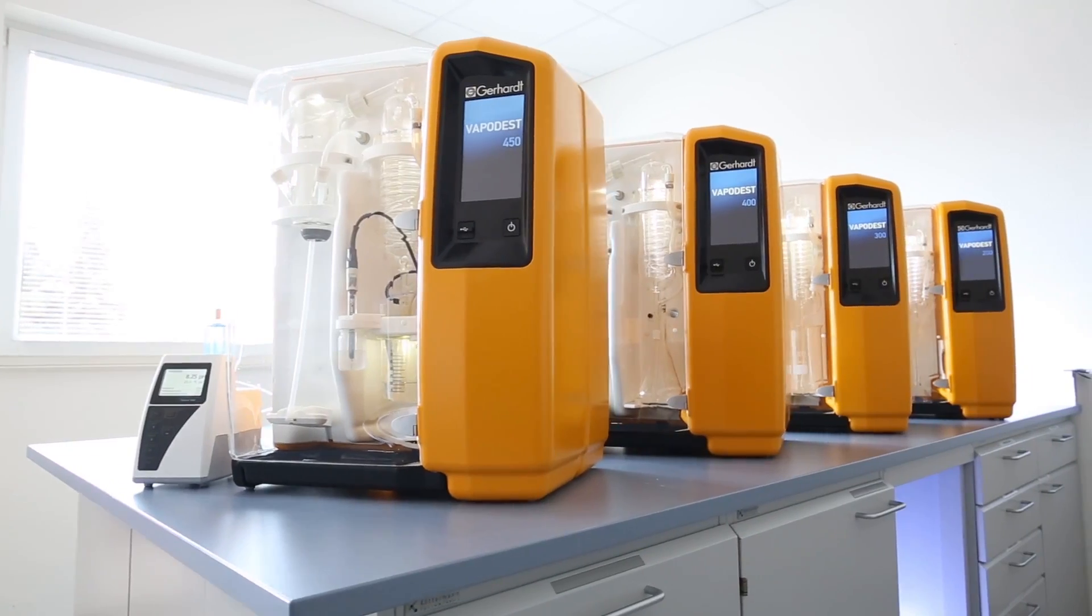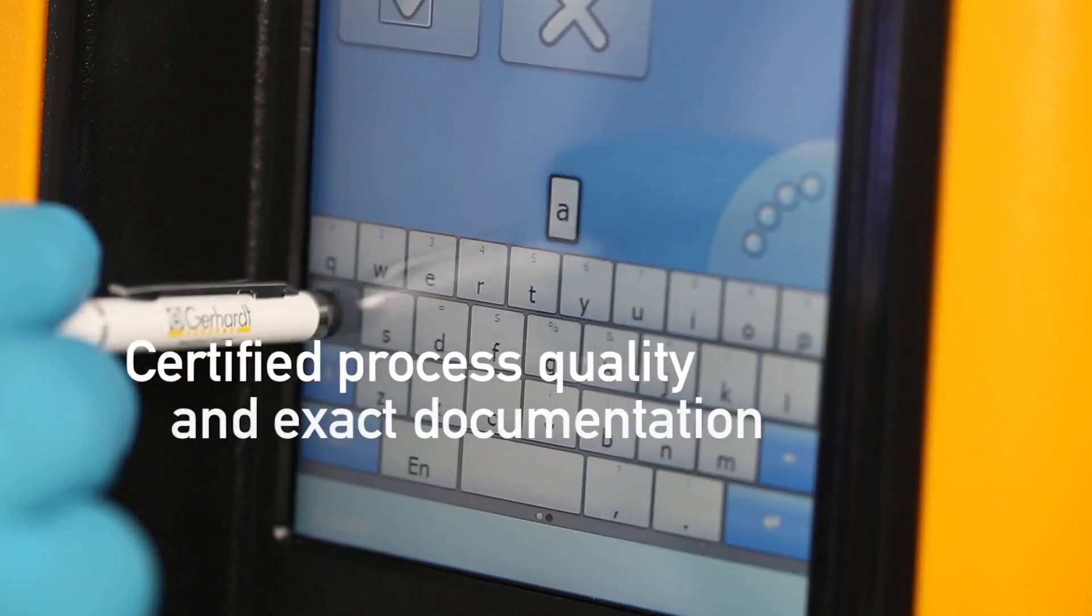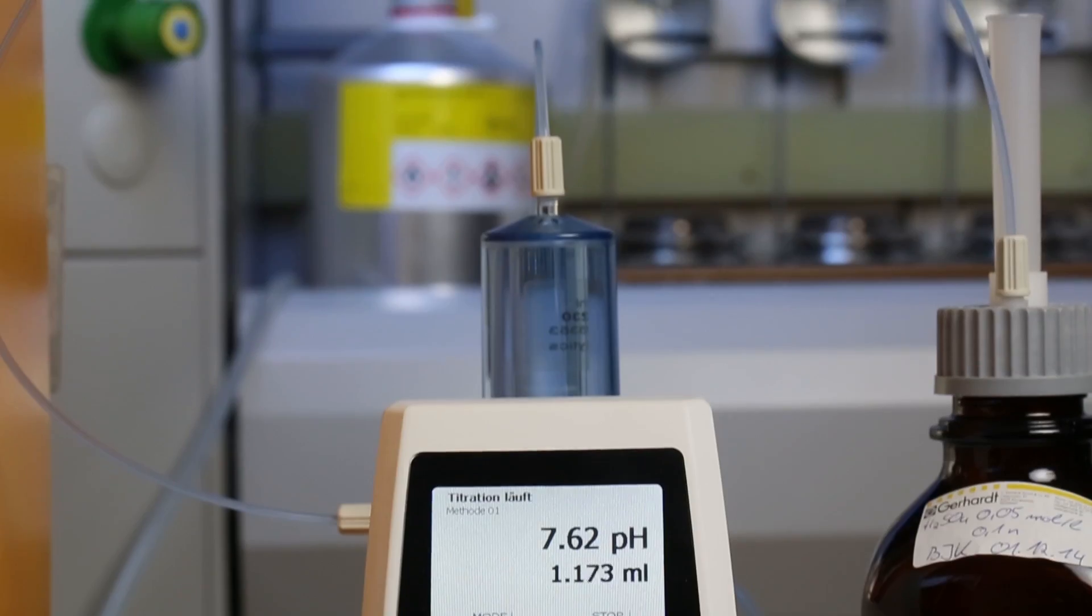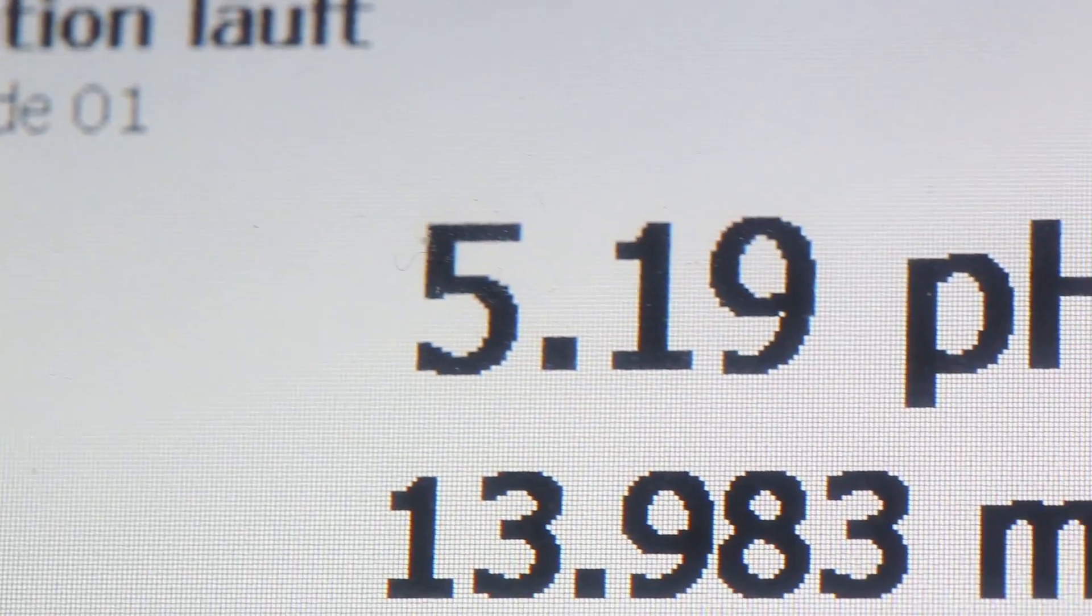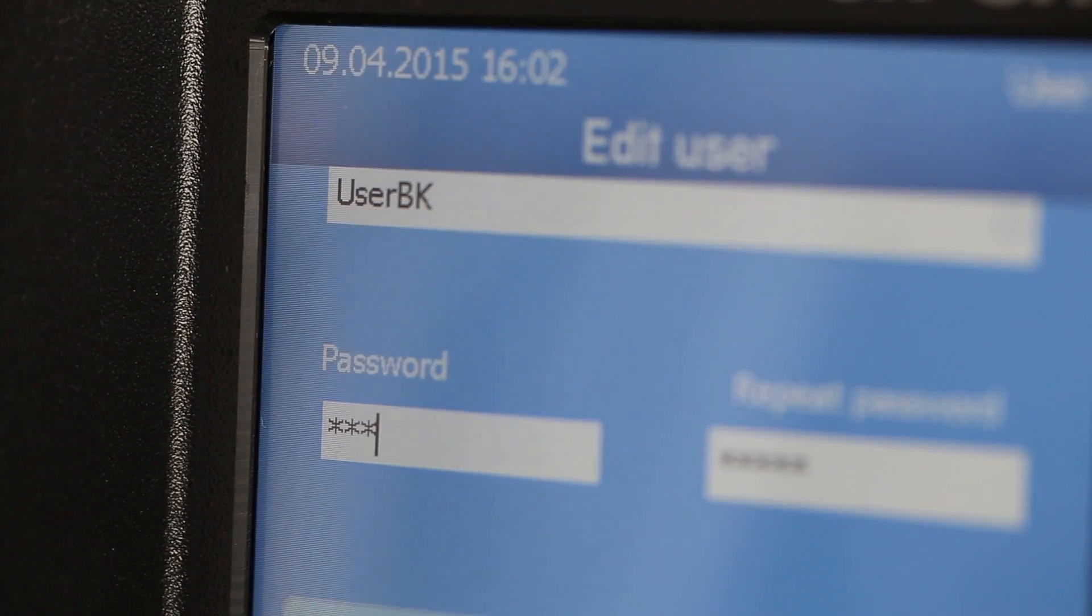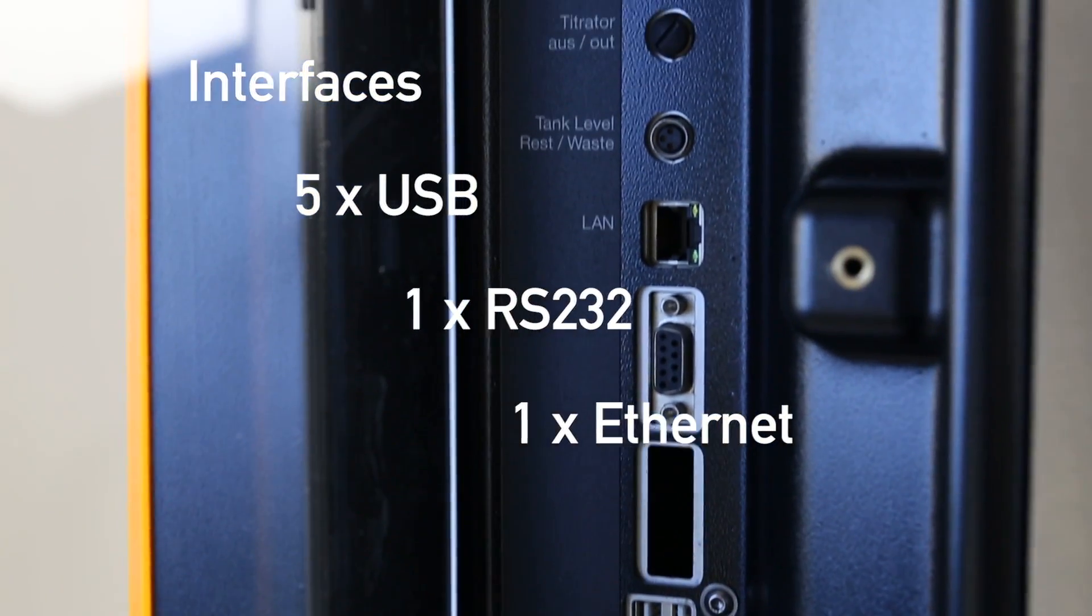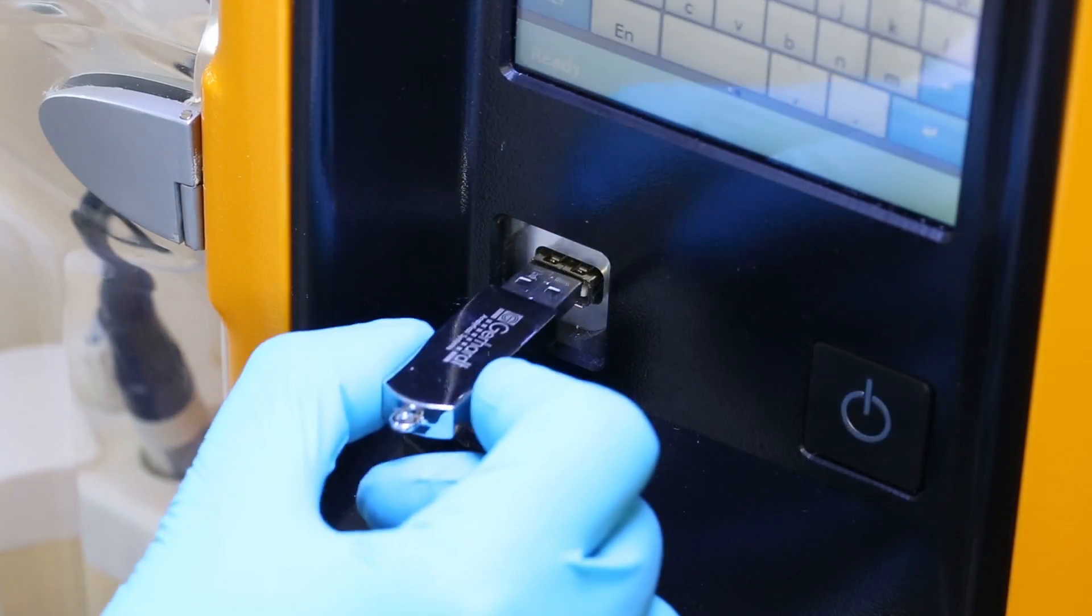Our new VapoDest devices now also do the laborious documentation tasks for you. They can record all relevant user, process and device data required by accredited laboratories in accordance with ISO 17025 and GLP. You can export the device data to LIMS by a USB stick.